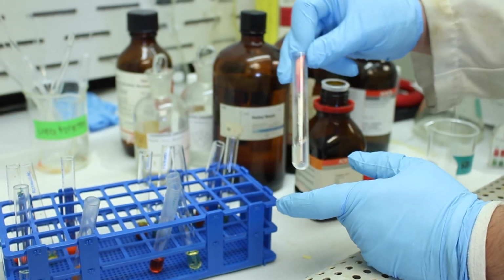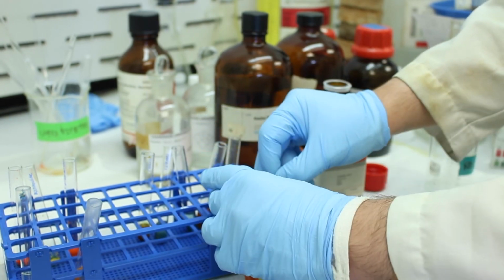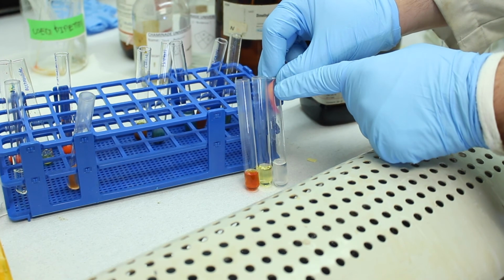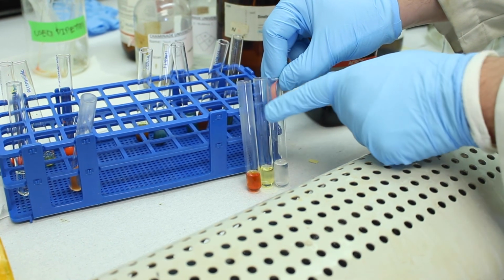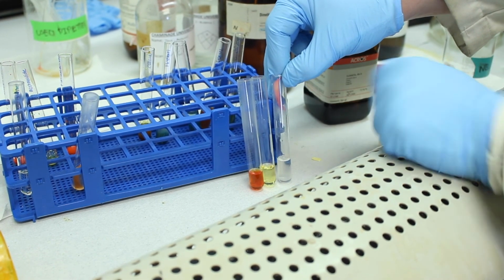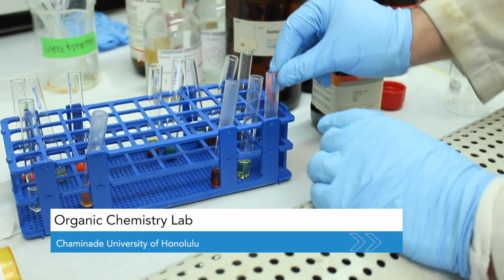Okay, so if we compare our samples here from left to right, left is our control, right is our dimethyl maleate, so this one needed heat, and then this is our EAS reaction with the guaiacol. Nice. So hope you enjoyed the lab, and you can use these observations to help you with the quiz.